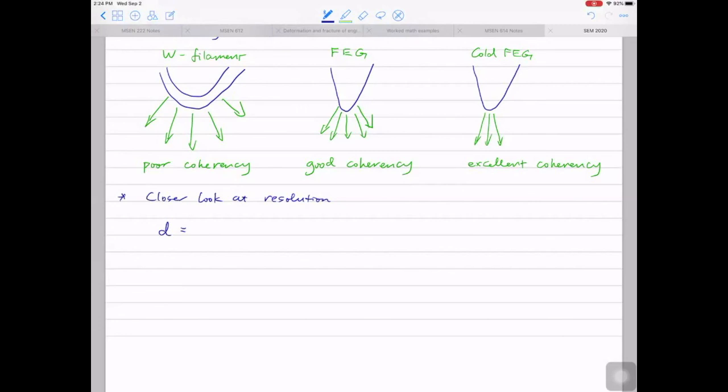So the resolution, if we expand it, it's written as the square root of the resolution from diffraction, that's called d_d squared, plus d_g squared, plus d_s squared. Let's look at each of these terms one by one. So d_d is the diffraction limit. And we talked about it, our good old friend, Rayleigh, so the Rayleigh criterion. I will not go through this again in detail.